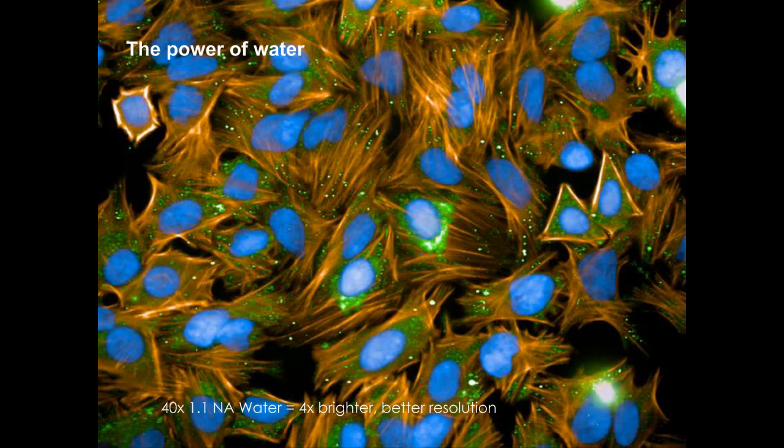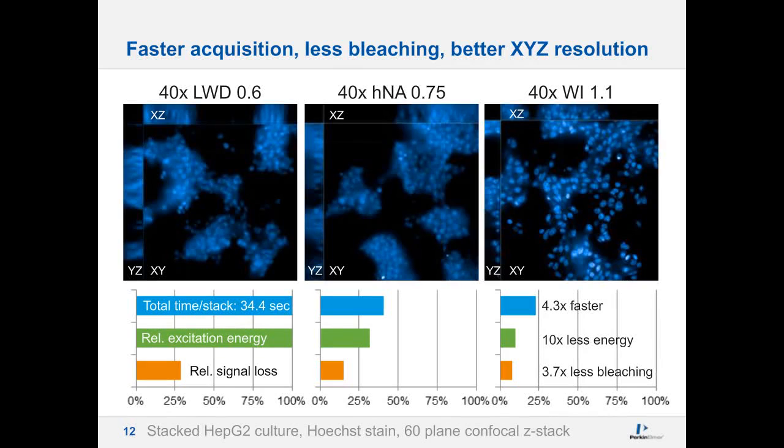The next slide, we try to put a more quantitative view on how different objectives on the Operetta CLS compare. In this experiment, we took a 60-plane confocal Z stack of a stacked HepG2 culture.